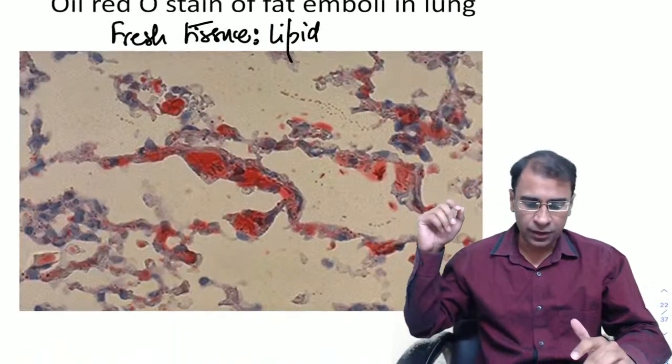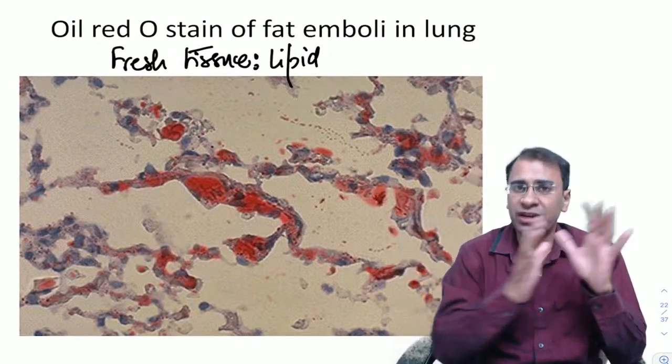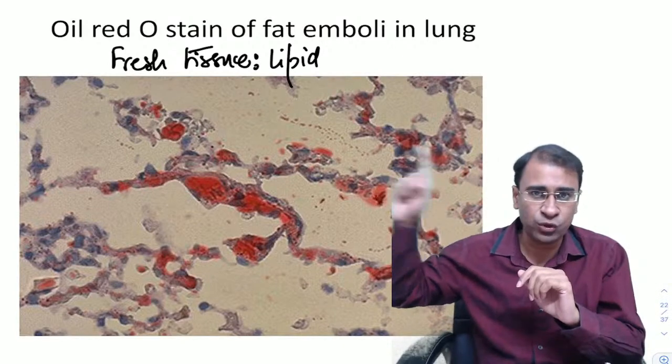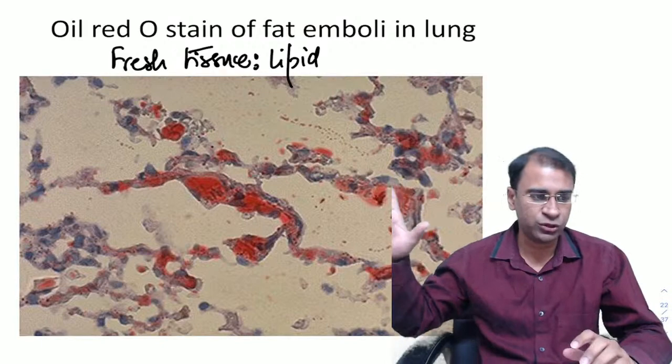Okay. Now we come to the oil red O. In the oil red O, we have used a fresh tissue lipid. Now this word fresh tissue lipid was recently asked in the AIIMS exam. Now make sure that you know this.